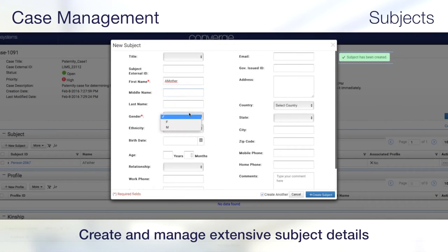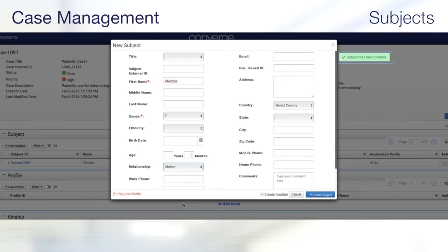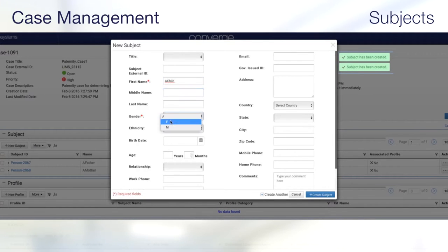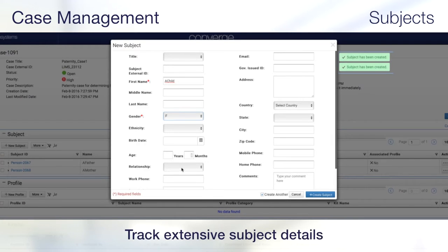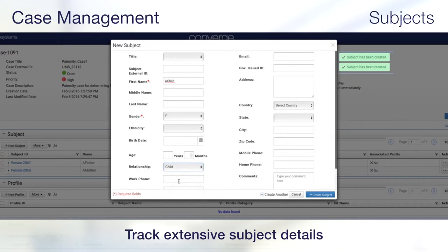You can also create and manage subjects through extensive subject details, capturing all necessary information that is saved, tracked, and retrieved. Multiple subjects can be entered without leaving the screen. Subject details include, but are not limited to, name, date of birth, ethnicity, address, phone number, and government-issued identification number.